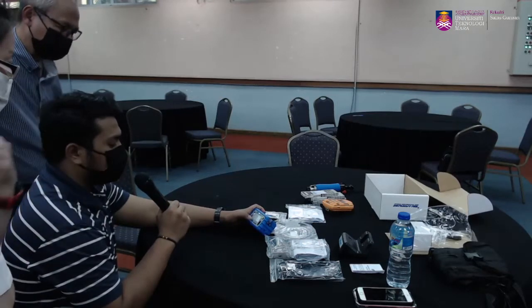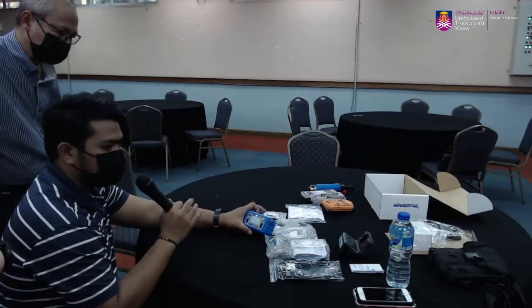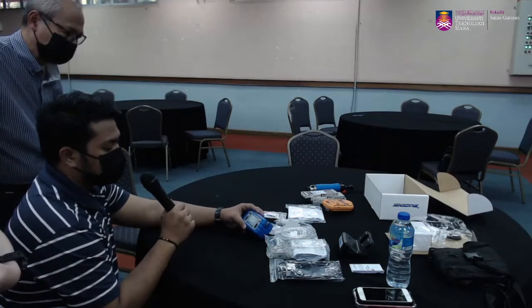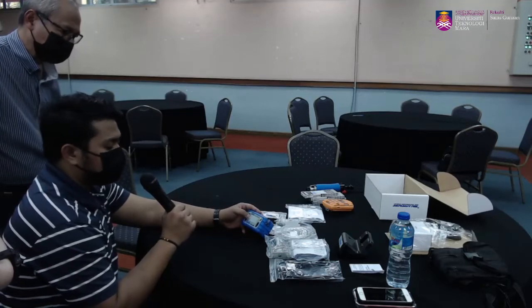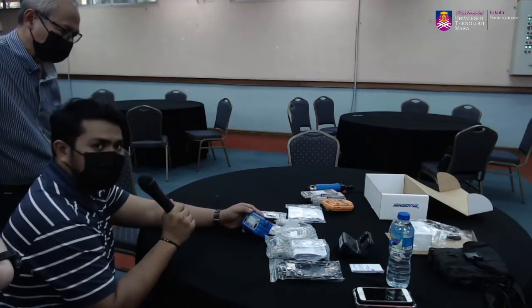Once it is stable, it will blink green. So blinking green means it has already fixed to our setting. And then it is difficult to change. In terms of the sensitivity of this pump, it can tell whether the media is connected or not, because it will show "connect media" until we connect the Tygon tubing with the media.